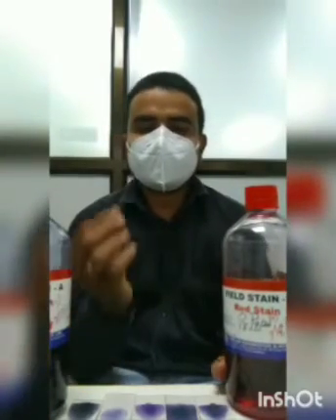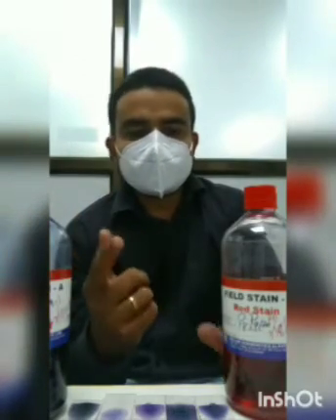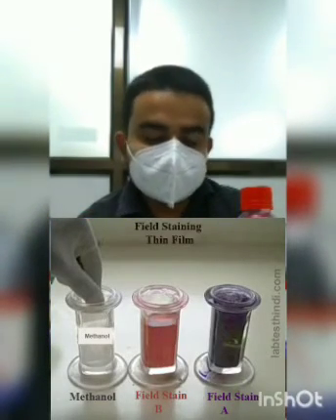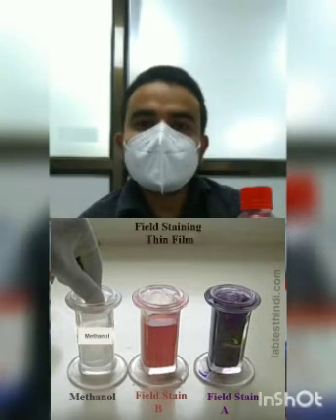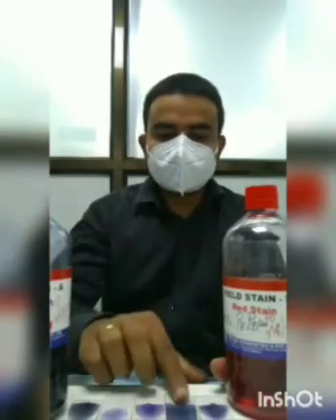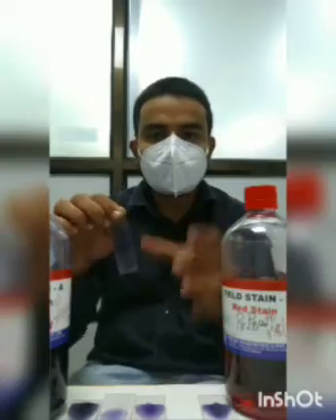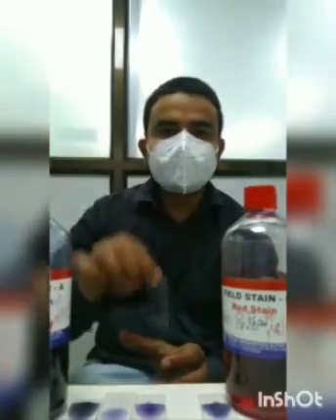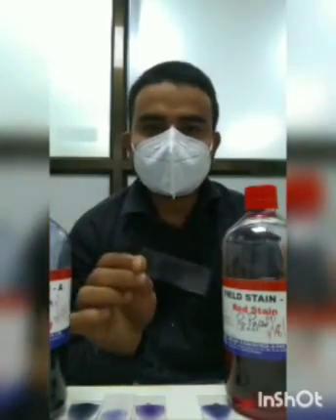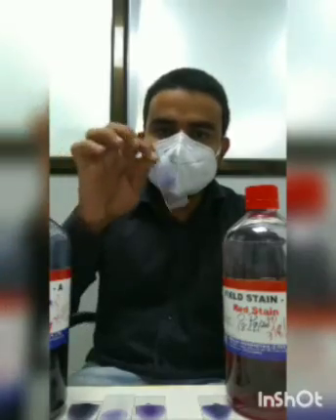Basic concept is, first, in a smear that is fixed in methanol, after it is air dried, we dip the fixed slides into the eosin Y, that is the Field B stain, for a time of 1 to 2 minutes. Or if we are using a dipping method, if you have filled this stain into a Coplin jar, we manually dip it in the eosin stain, 10 to 15 times. Then we wash it off completely under running water.